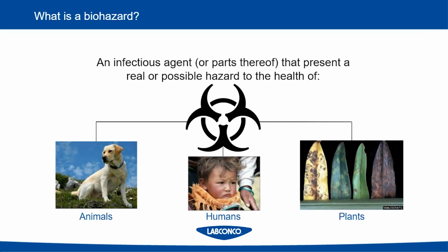I always like to start by defining what a biohazard is and why you would need biosafety cabinets in the first place. We get a lot of questions at LabConco regarding biosafety cabinets and their use, so I like to lay out what kind of hazards we're talking about when we talk about biohazards. In a very general sense, a biohazard is any kind of virus, bacteria, or particulate that can affect plant, animal, or human life in any way.